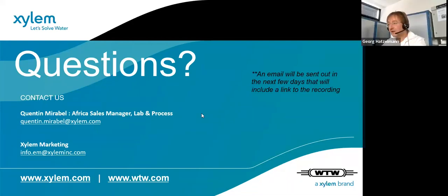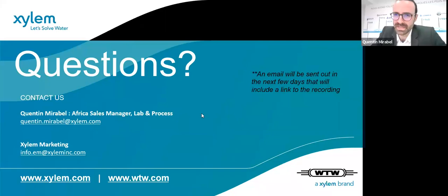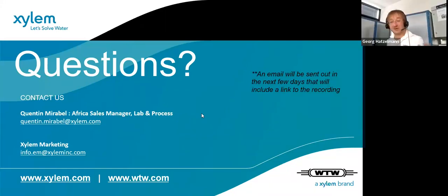Okay, and so you have the answer, right? About seawater? Yes. Okay, I'm sorry, go ahead. I'm always careful with answers. If I'm sure, I say it. If I'm not sure, I check it. So back to the question, UV and UV-Vis sensors in seawater applications. The NO3 and NO2 algorithms are not suitable for such an application.